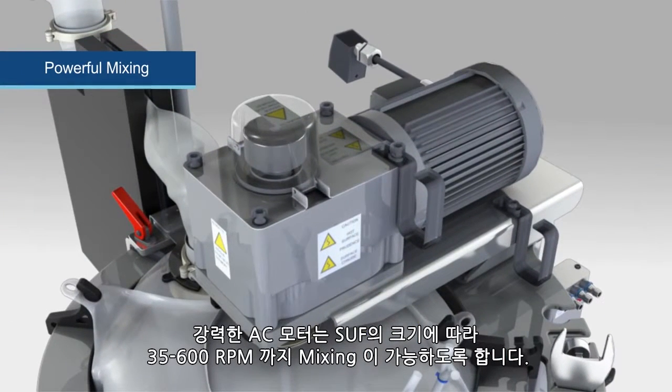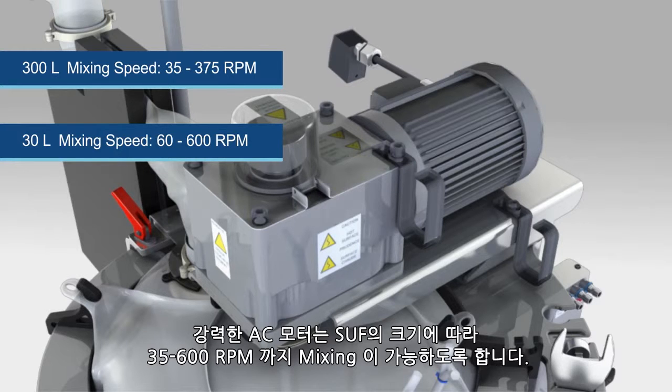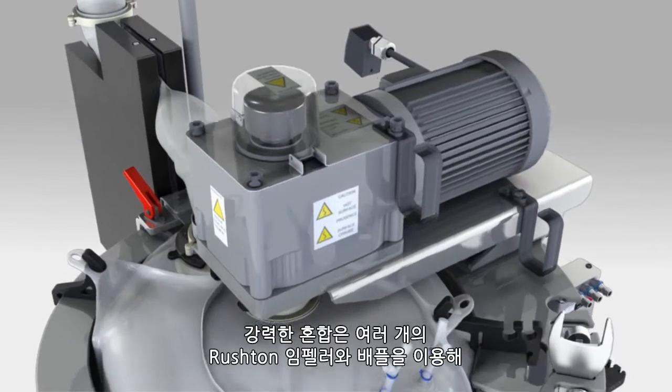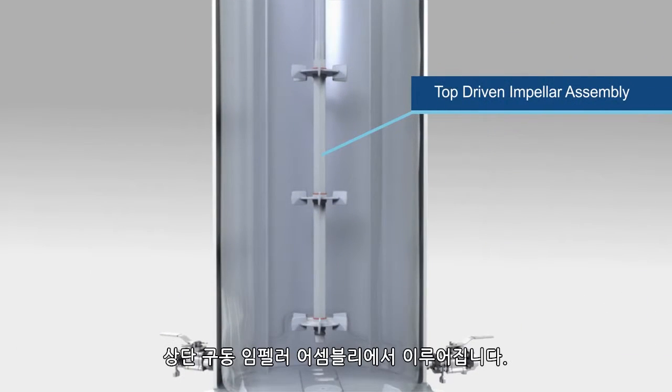The powerful AC motor supports mixing rates ranging from 35 to 600 RPM, depending on the size of the fermenter vessel. Powerful mixing comes from a top-driven vertical impeller assembly, utilizing multiple Rushton impellers and baffles.